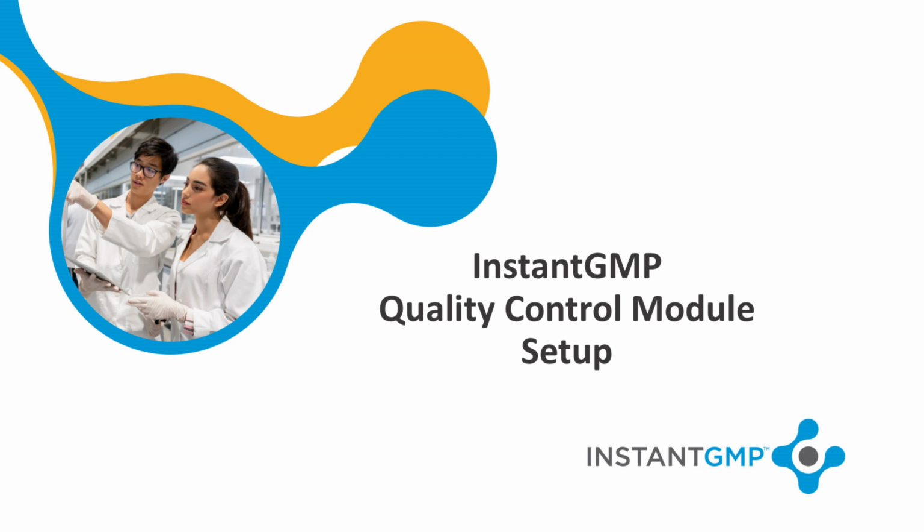In this video, we'll walk you through the setup of the Quality Control Module, your foundation for managing and executing analytical testing in a GMP-compliant environment.